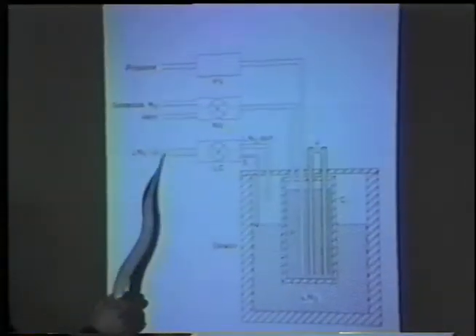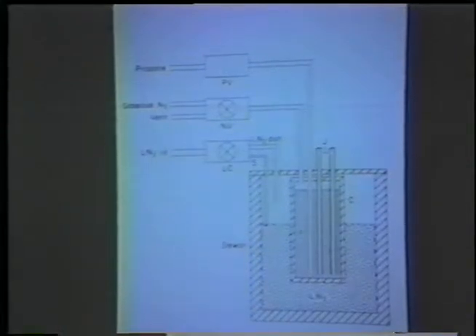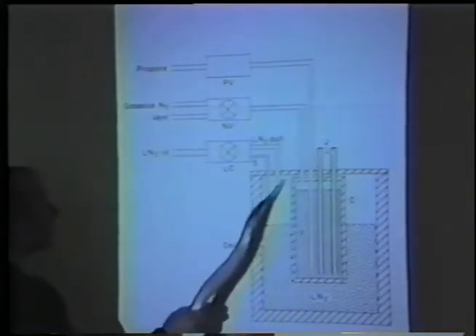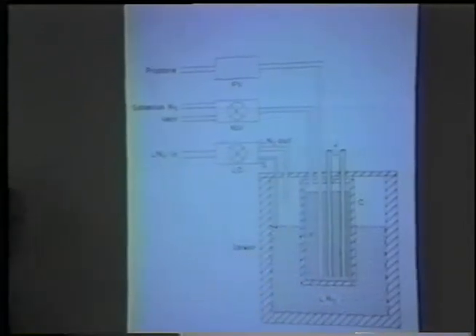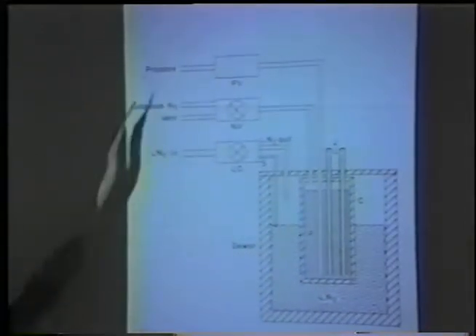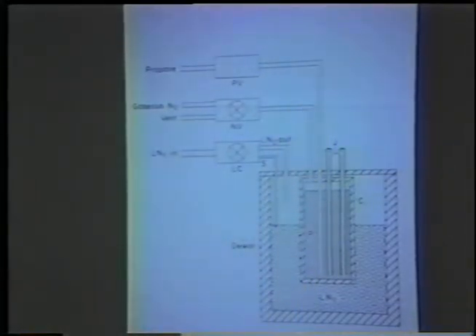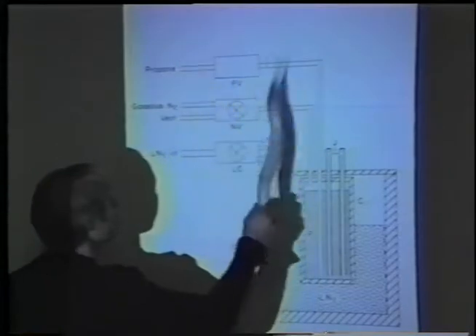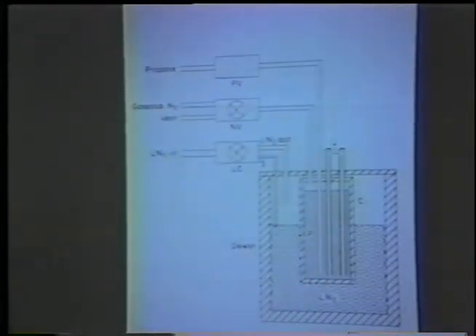The level of liquid nitrogen is controlled by a level controller sensor set at the level that you want the nitrogen to be. The liquid nitrogen cools a metal cylinder. When the metal cylinder is cool enough, we admit propane, and I've recently found that one can use Freon 12 or Freon 13 and get decent freezing in this machine if you really don't want to use propane. You admit the cryogen into the cylinder, it liquefies and pretty much fills the cylinder.